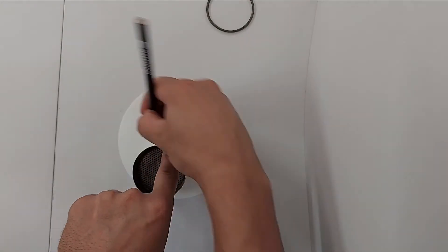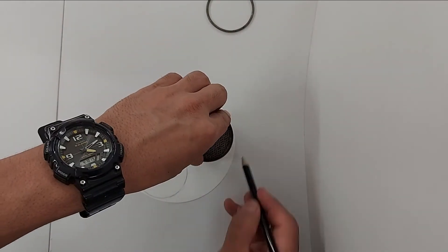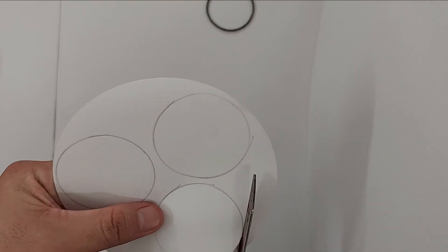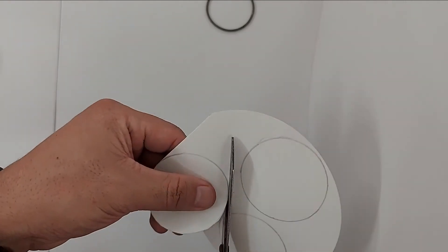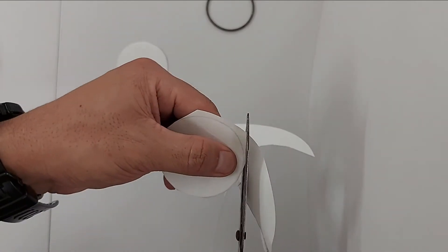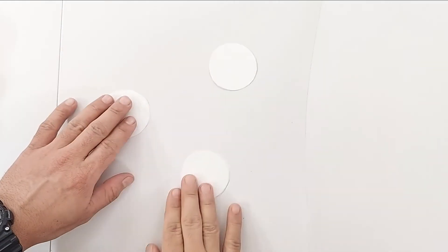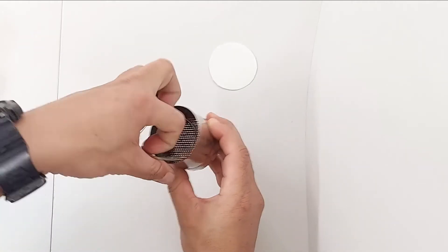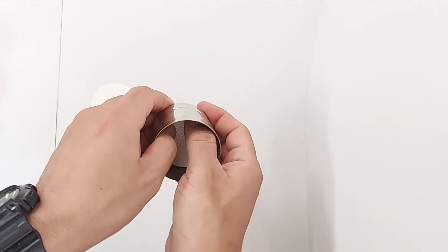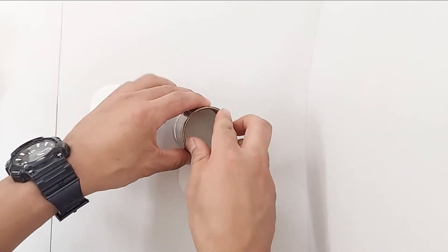Take the Whatman filter paper number 42 and cut it into the appropriate size to fit the Keen Box, then place the filter paper in the Keen Box to cover the whole perforated bottom of the box.